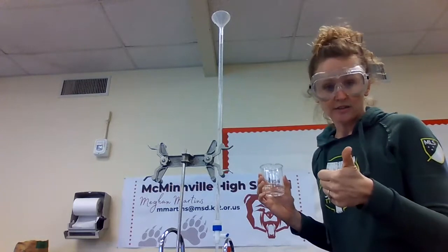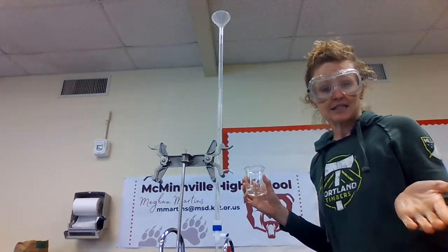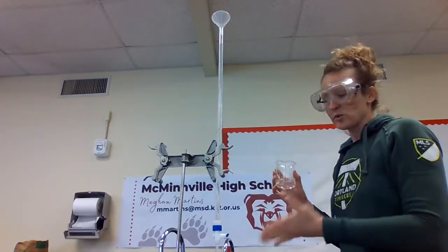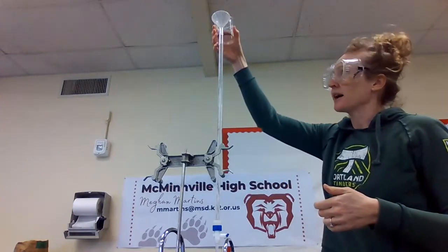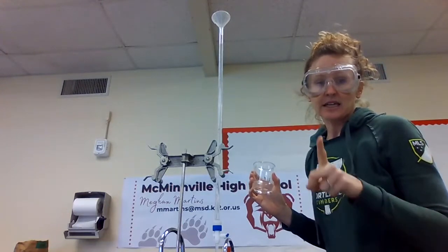If it's water, it'll dilute your base, and your base won't be the concentration you think it is. If it's acid, it'll neutralize your base, and your base won't be the concentration you think it is. So you rinse through once with base into a dump container, and then you fill it back up and mark where you start.